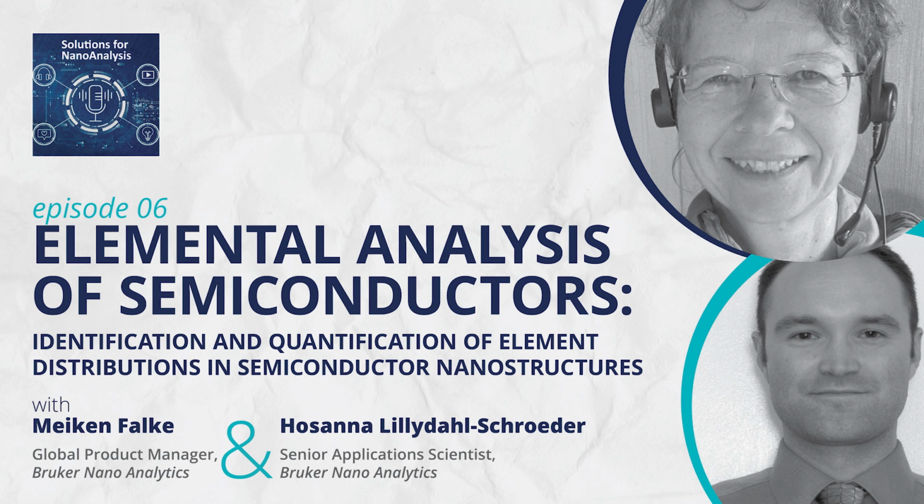But back to the experiment. With just the one detector with the light element window, it took about 2 hours to see some phosphorus and arsenic, and that was only possible with heavy pixel binning. With the newer annular high collection angle arrangement of several windowless detectors, a 200 times increase in X-ray count rate was observed, and it took only minutes to get a much better dopant distribution for arsenic and also the lighter phosphorus. On top of that, the EDS sensitivity allowed even to see the bumps in the EDS background, which are caused by coherent Bremsstrahlung. So this paper is something I do recommend to everyone who is serious about analyzing semiconductor materials.